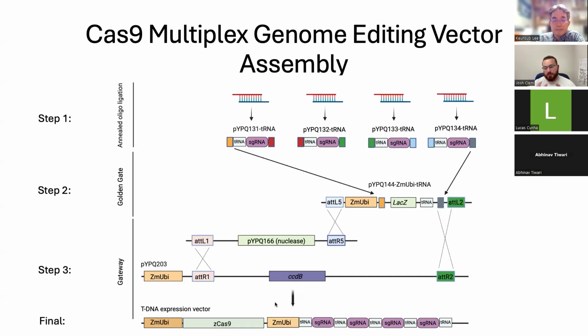So we typically use polymerase 3 promoters in dicots, by the way. Just historically, that's how we've done it. They're also very effective in monocots, though, so nothing wrong with that. They're typically terminated by poly T, so multiple T's in a row signal termination, so they don't require a polymerase 2 terminator. And then other design parameters, if you do opt for polymerase 3 U6 or U3 promoters, which we have compatible with our vector system. I might have a slide on that. I might need to check.